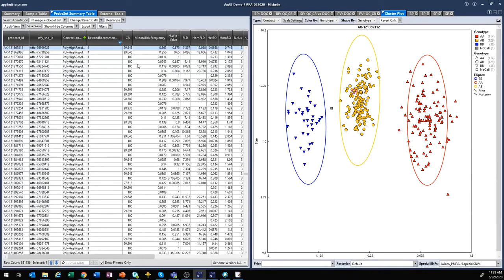That has now created a probe set list in the same format I showed before with the text file. And in the future, if I'm analyzing another set of data and want to use that specific probe set, I can load the data under Manage Probe Set List, input that probe set list, and the future data would be filtered off of that.